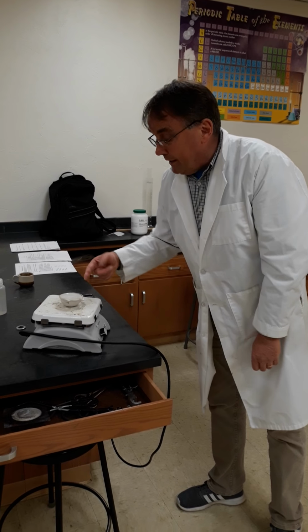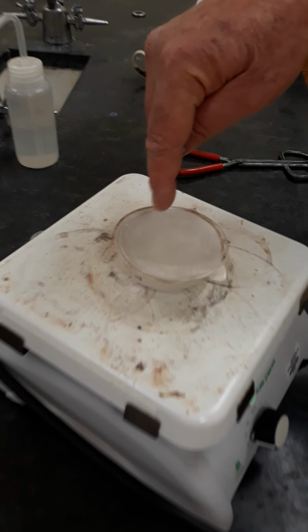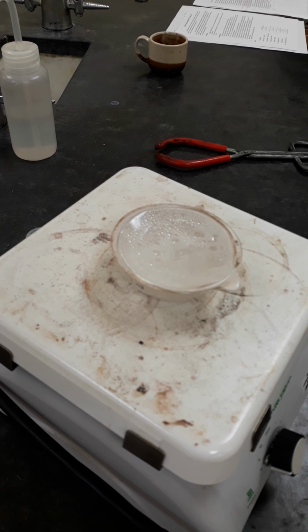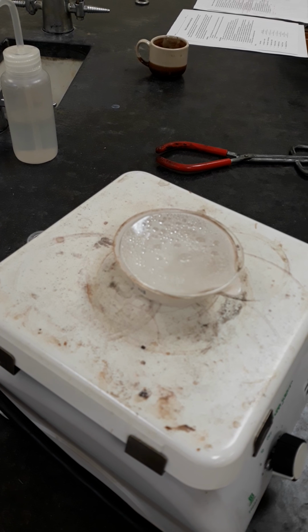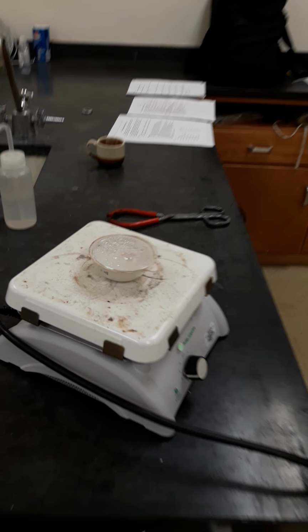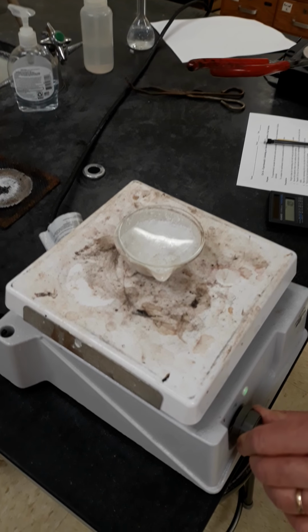Okay, so now it's boiling. So it's time to put the lid on, and you can see from the condensation on the lid how much longer it's going to take. But with the lid like this, the evaporation is free to escape, and so we'll come back in another 10 minutes or so when it's totally dry. Okay, you can see now that it's completely dry, and so guess what we have to do? Take it off and let it cool.